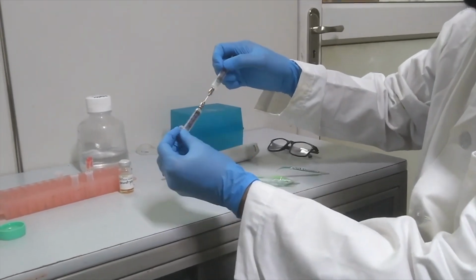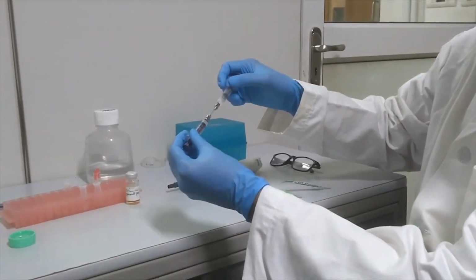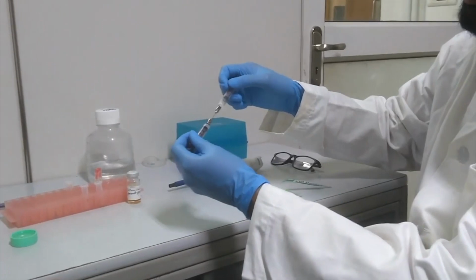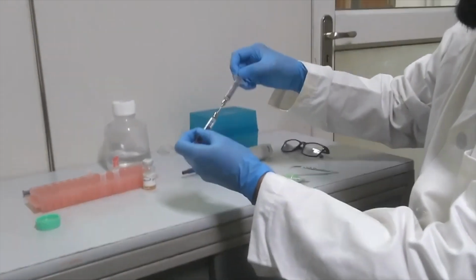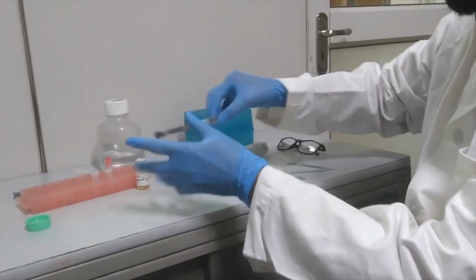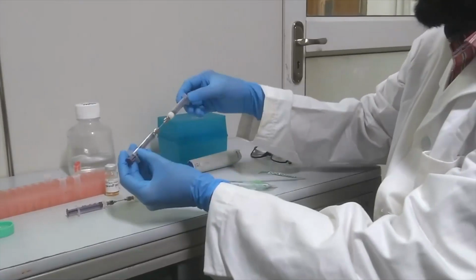Emulsion can be called water in oil or oil in water because both are in the same concentration, same volumes. So you can call them either way. By this method the emulsion is formed. For ready reference, we have already prepared the emulsion.